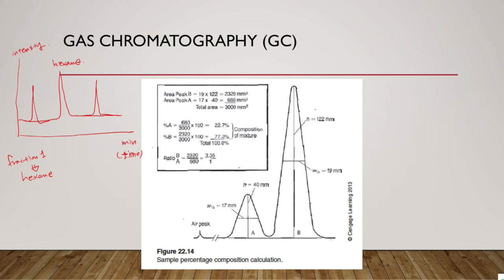So it really depends on the purity of the sample you're running or checking. If it's pure enough, almost 99%, then you will only see one peak. But if it's not pure enough, then it will show even 1-3% of the impurities here.